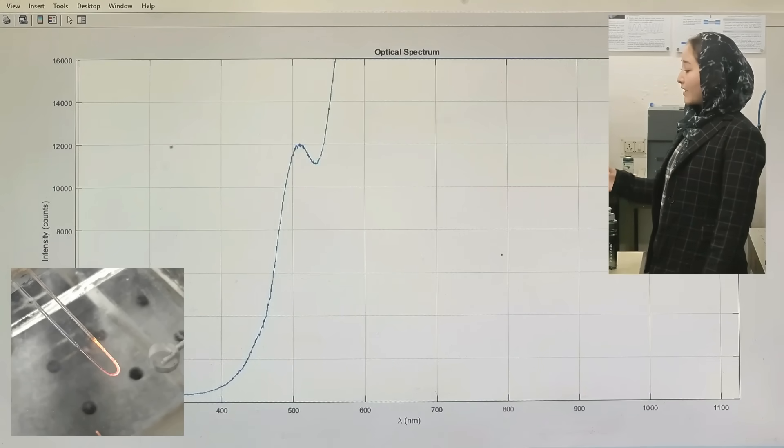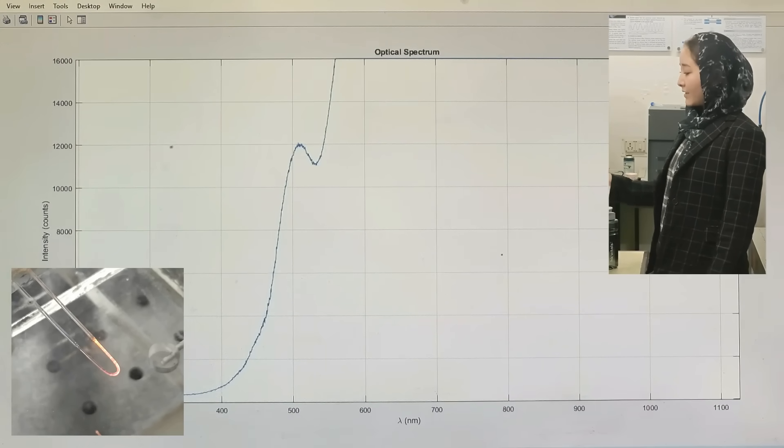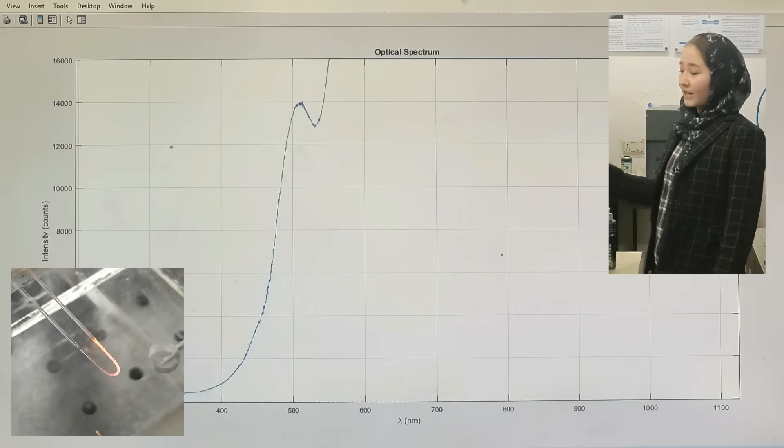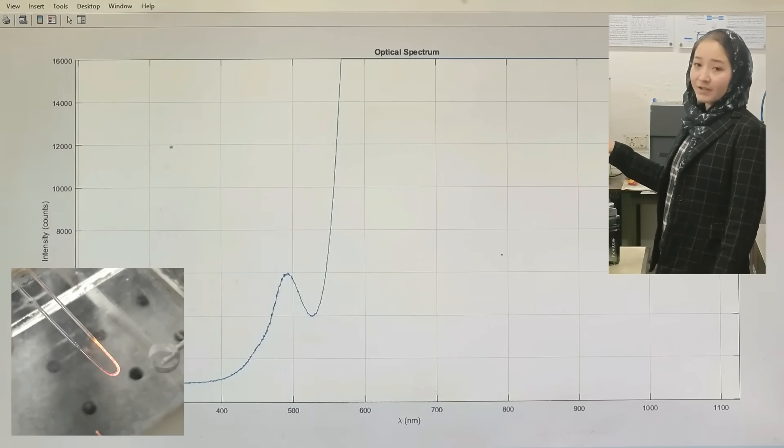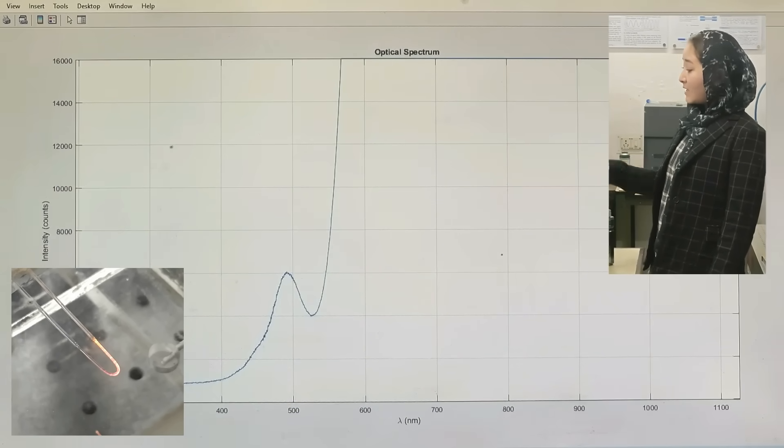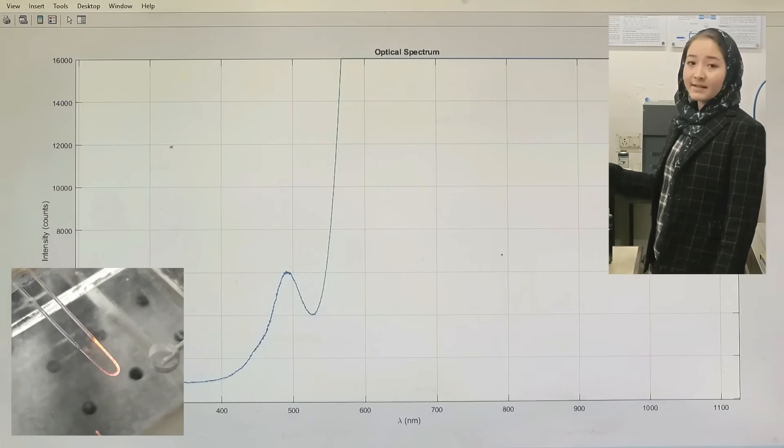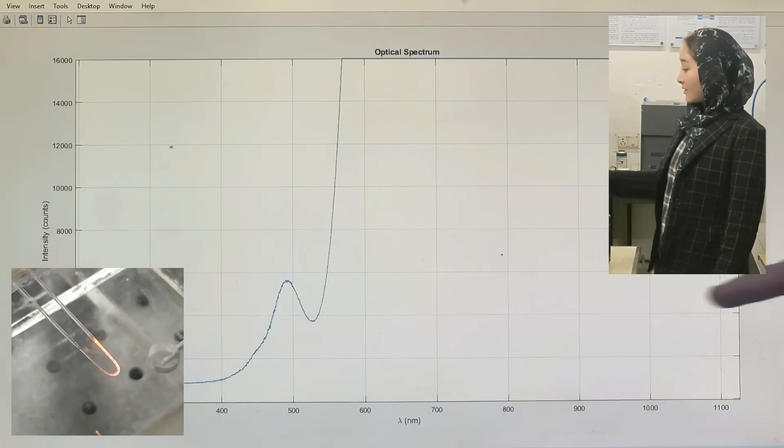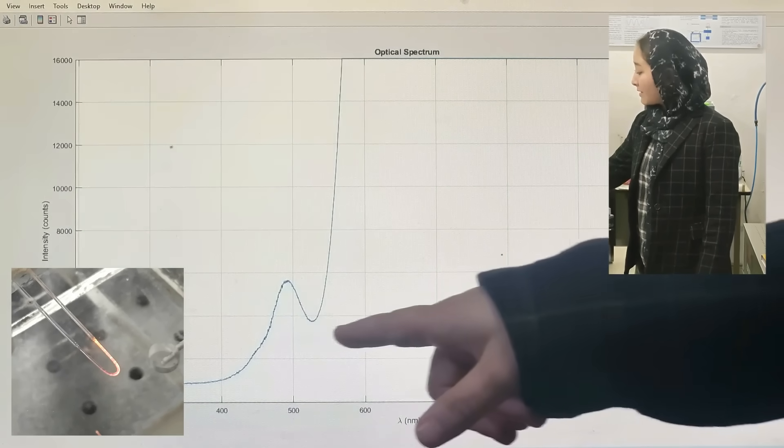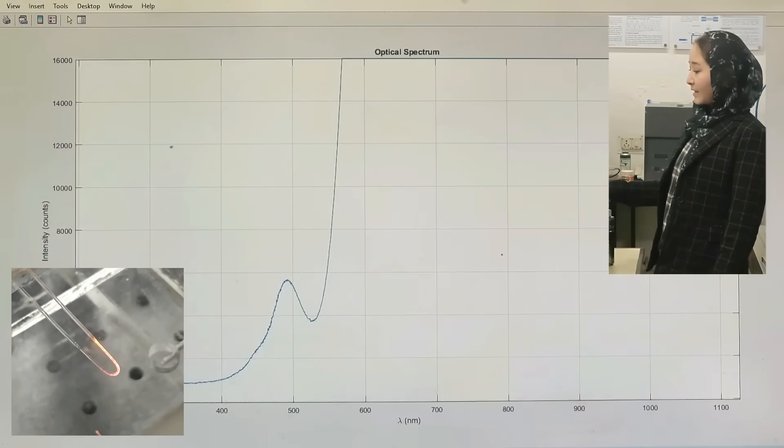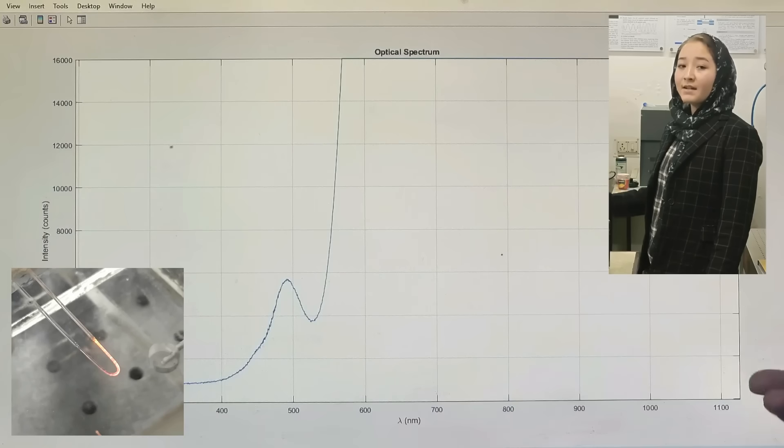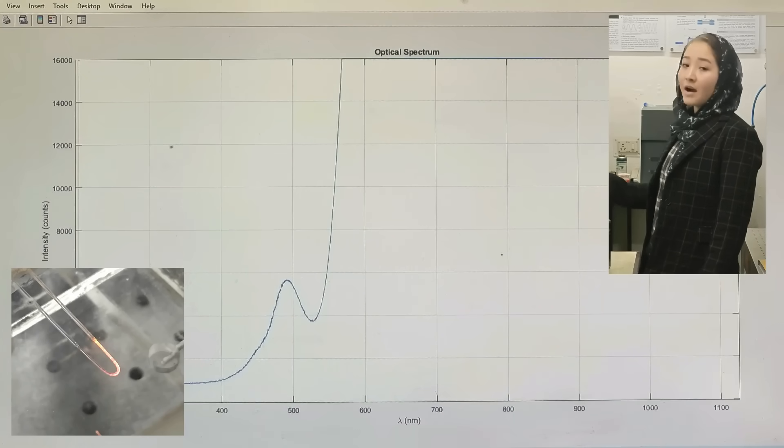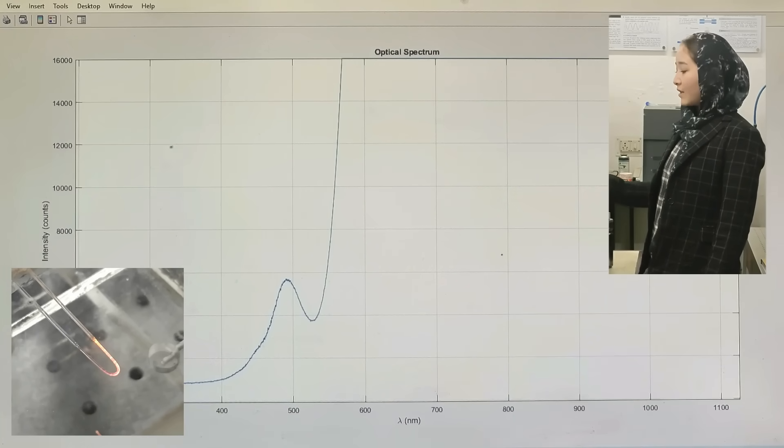Now I am going to expose the sensor to some real water sample which contains some amount of arsenic in it. As you can see, when we expose the sensor to the real water sample, the LSPR spectrum changes instantaneously and the resonance dip also changes instantaneously. This shows that our sensor can give instantaneous information about the arsenic content present in the real water sample.